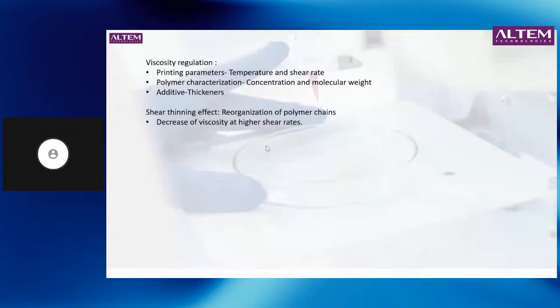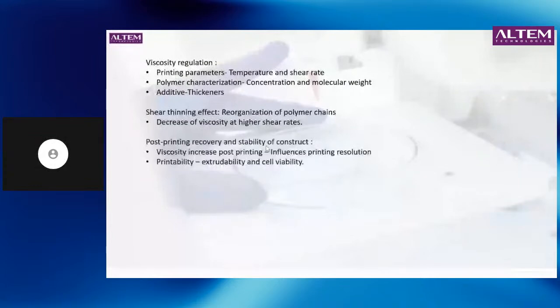Shear thinning effect is basically the reorganization of the polymer chains. There is a decrease of viscosity at higher shear rates. You have post printing recovery and stability of the construct. So the viscosity increases post printing.